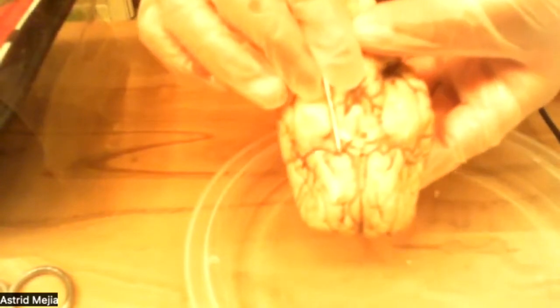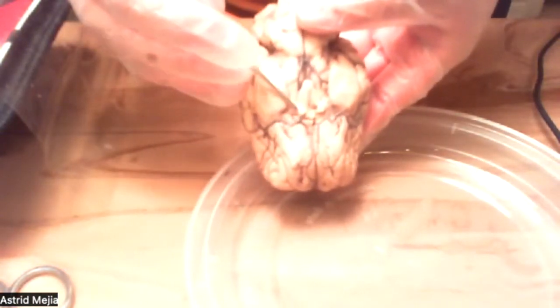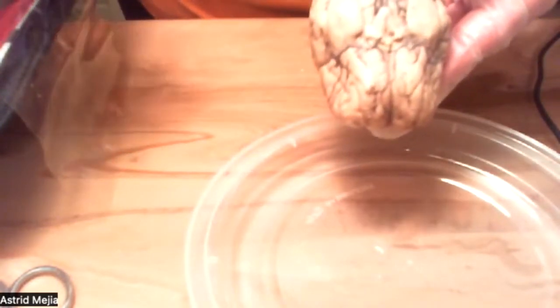And the optic chiasm allows for the crossing of the fibers from the nasal retina to the optic tract on the other side. And then there's going to be the optic nerve, which is basically this part. It transmits sensory information for vision in the form of electrical impulses from the eye to the brain.